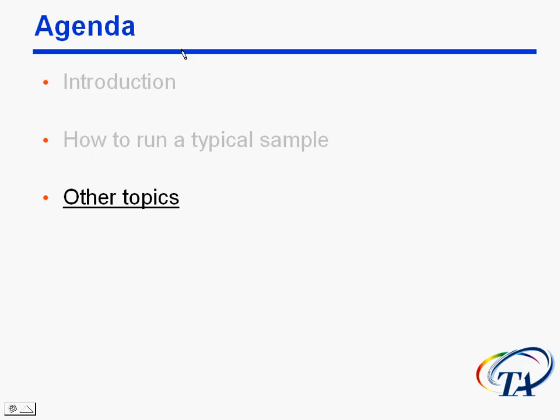Now before we go on, let me just make a comment. This course is really on the TMA, and I showed you just the brief points of Universal Analysis. We have a Quickstart training course just on Universal Analysis. So, feel free to go back and take that. That would be, I think, beneficial for you if you're not really used to using Universal Analysis.